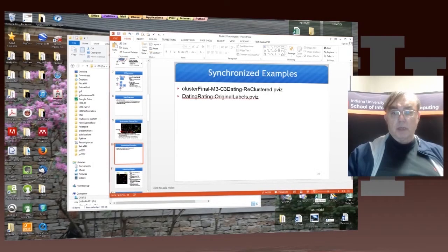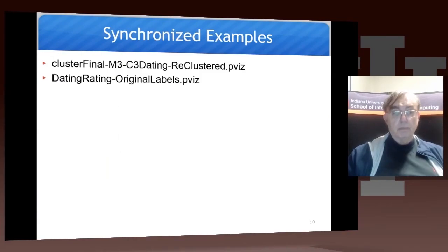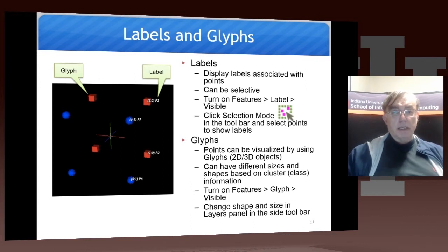Now we come back to PowerPoint. The next one discusses things we've actually briefly looked at already: glyphs and labels. The labels are on the cube one, and you can either set the labels by clicking on the point, or you can set it by using the selection mode by drawing a window, and then you'll find the label for the points in the windows.